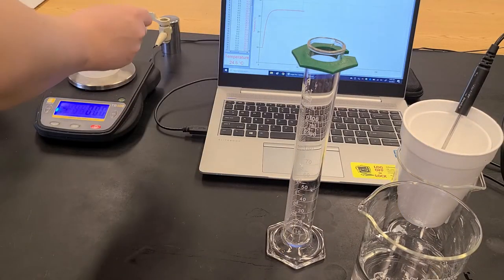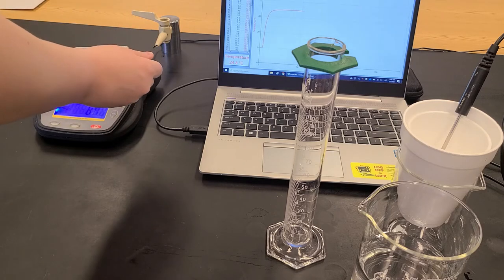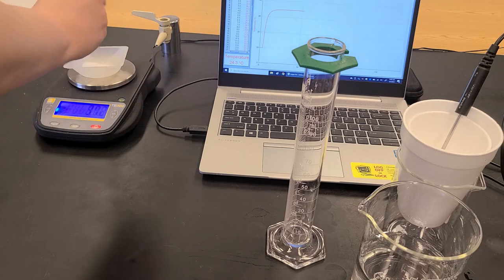And it's not really important that it's 5.00 or that it's exactly on whatever number I'm aiming for. All that matters is that I know the mass. I need to know how many moles of this solid are dissolving in my water.